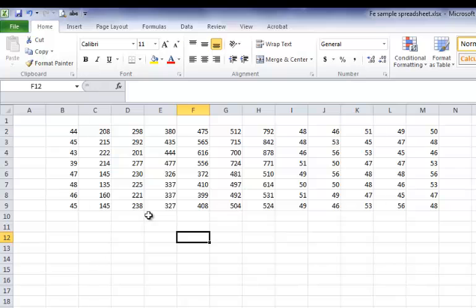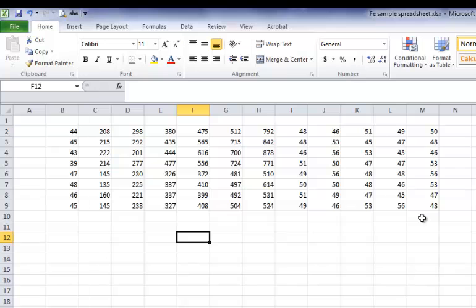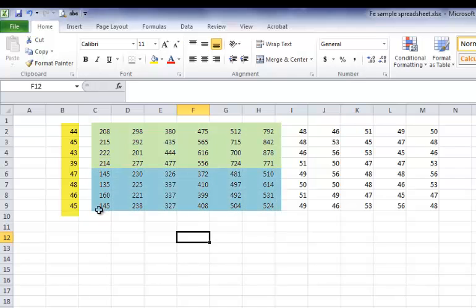The iron experiment is done using a plate reader, and this is the output. So we have all the different wells in the plates and all their absorbance readings. As you can see, if you look at the last 5 columns here of numbers, they're all around 50. Those are in fact empty cells. They didn't contain anything, so we can ignore them. What we do have here is we have our blank here in the first column, and then the first 4 rows are our standards and the bottom 4 rows are our unknowns.